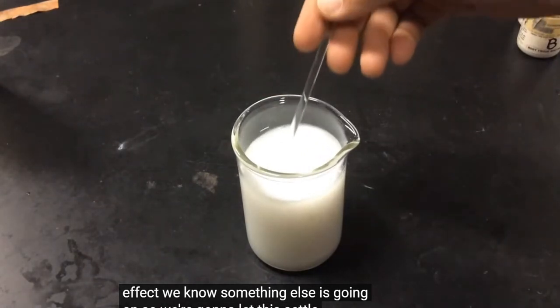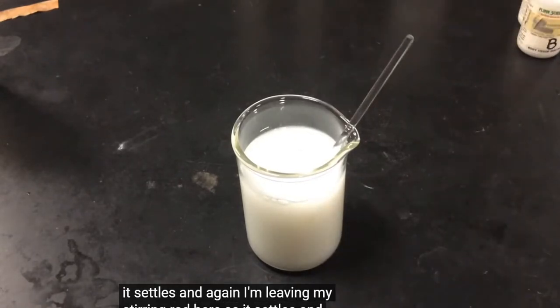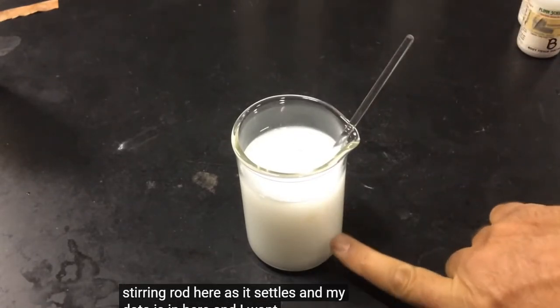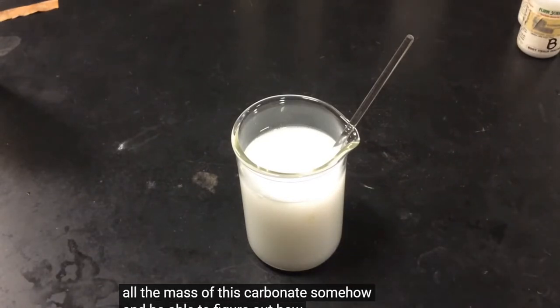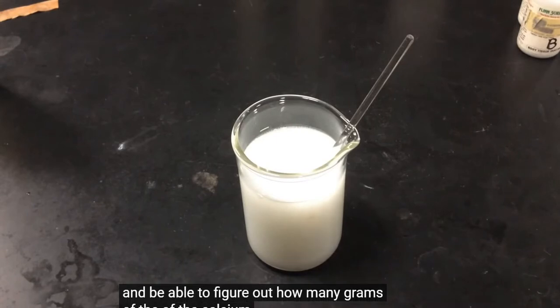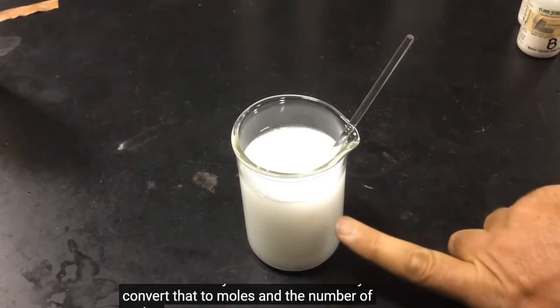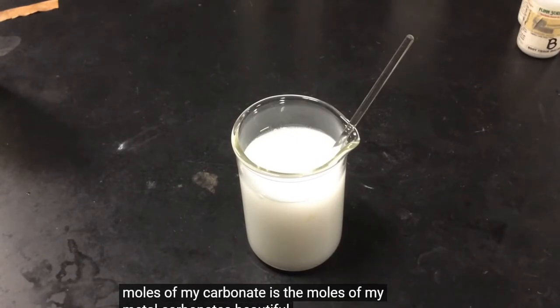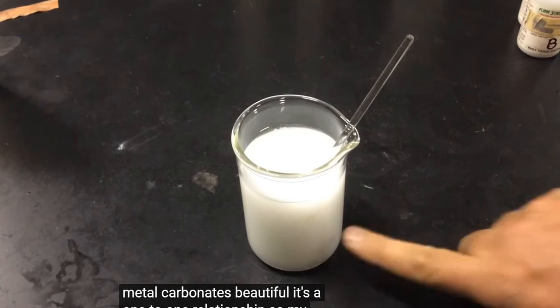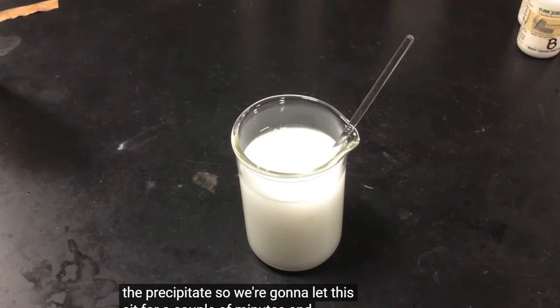As it settles, and again I'm leaving my stirring rod here, my data is in here, and I want to collect all the mass of this carbonate somehow, and be able to figure out how many grams of the calcium carbonate I have, which essentially is chalk, and convert that to moles. The number of moles of my carbonate is the moles of my metal carbonate. It's beautiful. It's a one-to-one relationship. So my data is in the precipitate. We're going to let this sit for a couple of minutes, and then we're going to filter this out.